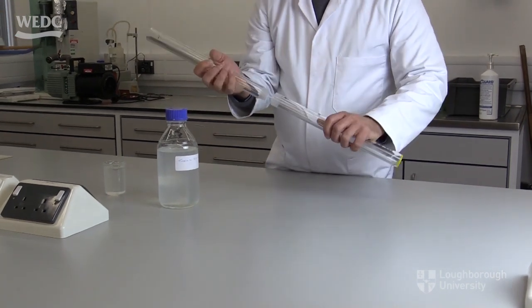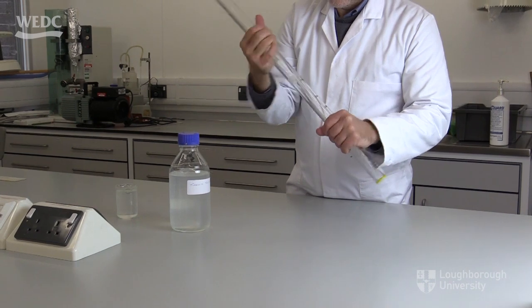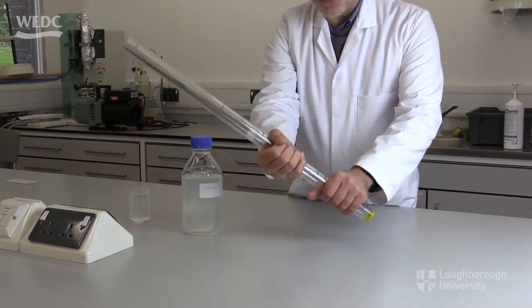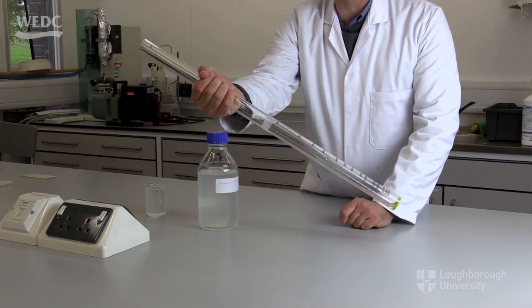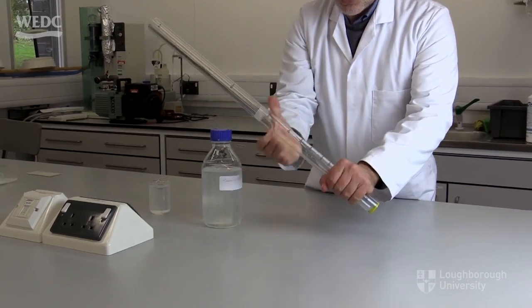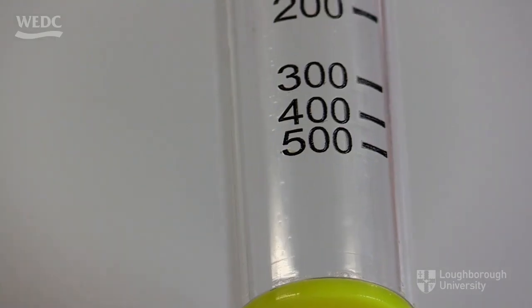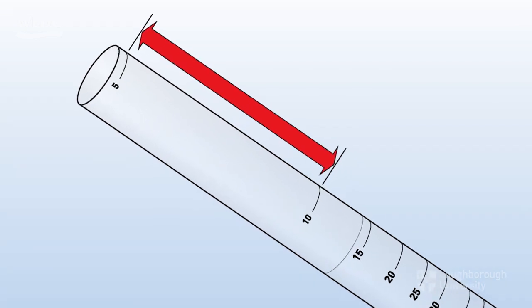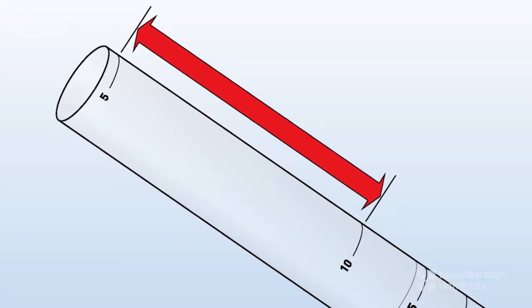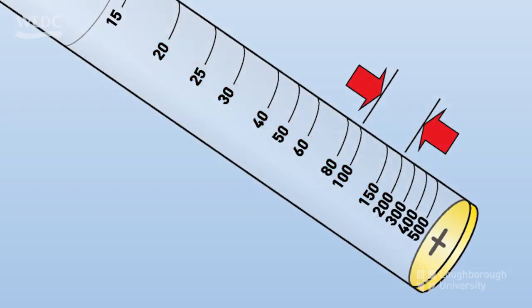This is what a turbidity tube is: a long, thin, transparent tube made of two parts that fit together so that it is easy to carry. Note that once it has been assembled, it should always be held by the bottom section to prevent the connection coming loose. There are graded marks etched on the tube. See that this scale is not linear. The distance between 5 and 10 is much more than between 100 and 200.